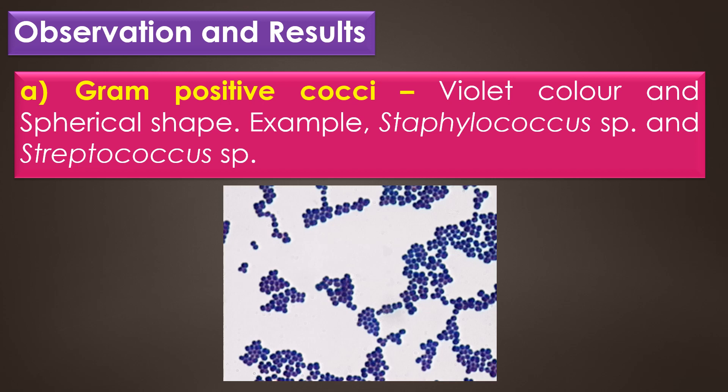Gram positive cocci appear in violet color and spherical shape. Examples for gram positive cocci are Staphylococcus species and Streptococcus species. Staphylococcus species are arranged in the form of clusters or grape-like structures, and Streptococcus species are arranged in the form of diplococci or chains. This image shows gram positive cocci arranged in clusters — Staphylococcus species.